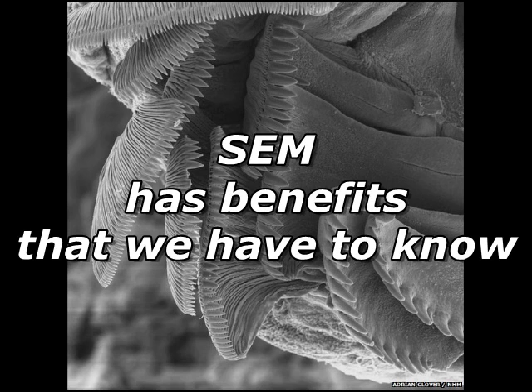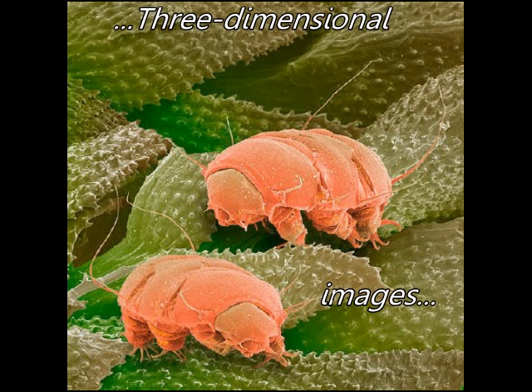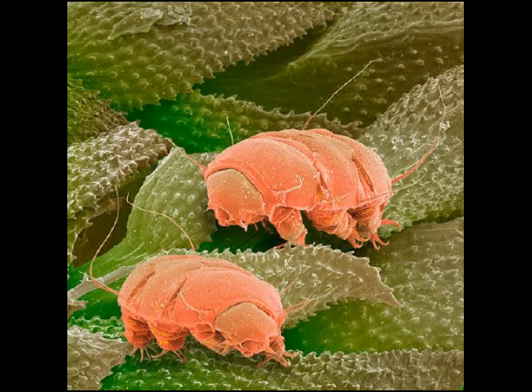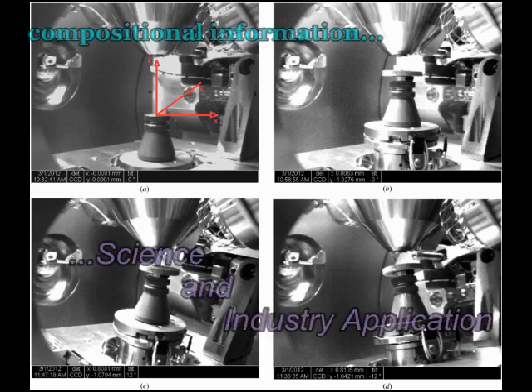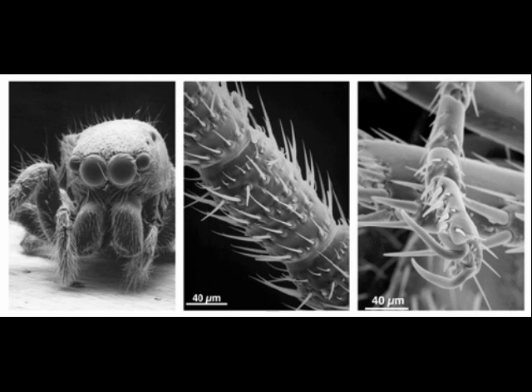SEM has benefits that we have to know. The higher resolution, three-dimensional images produced by SEMs provide topographical, morphological, and compositional information, which makes them invaluable in a variety of science and industry applications.